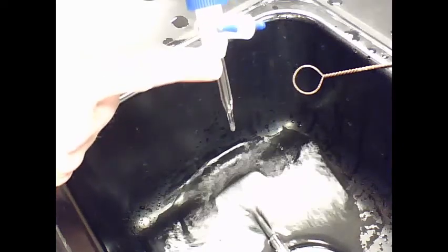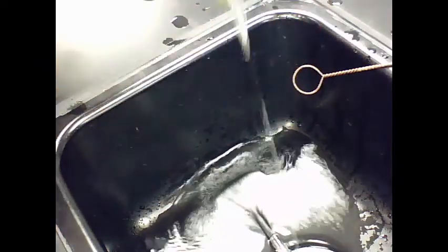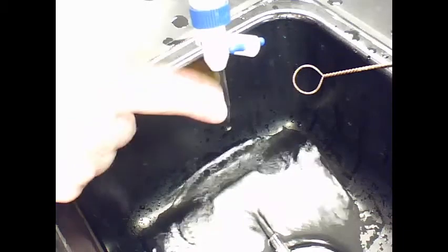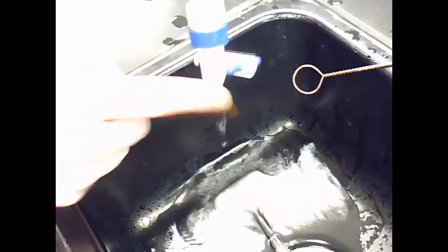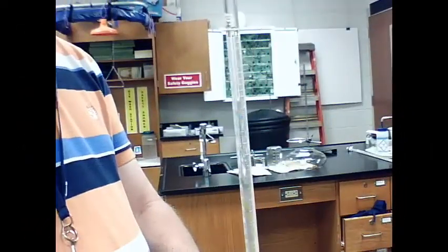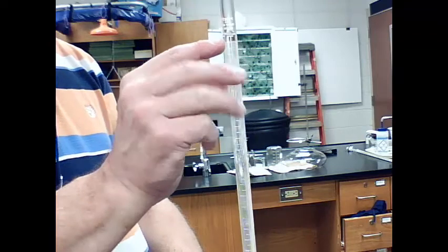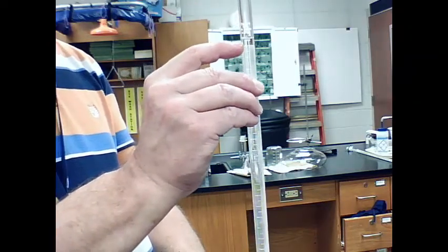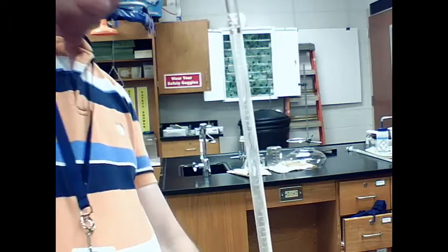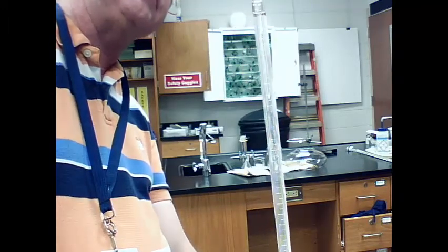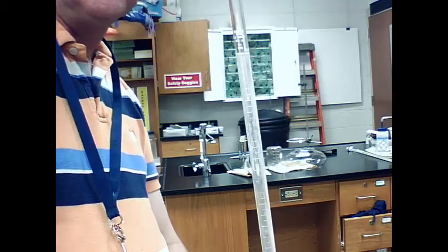so that whatever was in here before is completely cleared out. I've filled the burette with my titrant solution. Now I want to clear the tip. And we're simply going to open up the burette like this and allow some fluid to flow through and get all the bubbles out. You might have seen a bubble go through there. And then close it up. And now I've got enough of that base solution flowing through here to completely clear out all the distilled water that would have been otherwise trapped here on the tip and would have affected my pH. So I've put enough titrant solution into the burette. So I've got a little more, a little bit above zero here. And I'm going to simply drain out enough of the solution so I get it down to exactly zero. And then I'm ready to start doing the titration.